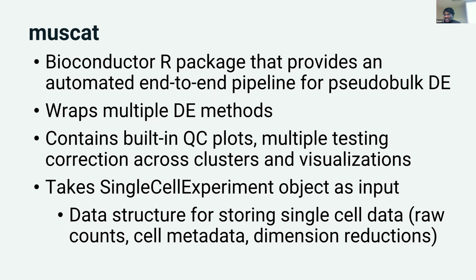To use this package, it requires a SingleCellExperiment object as input, which is basically a Bioconductor data structure for storing single cell data. And this data structure can contain raw counts, metadata, dimensionality reductions, all in the same object. So it's the Bioconductor equivalent of a Seurat object.